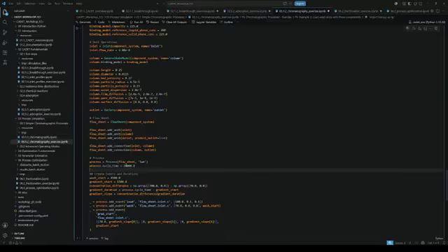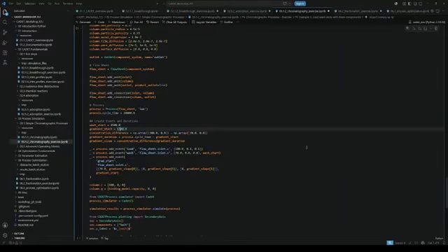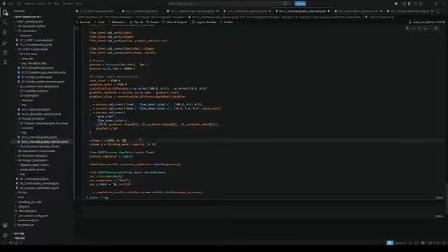Our process is to take up 20,000 seconds. And since this is a bind, wash, elute cycle, we have to define some timed events so that the wash starts after 4,500 seconds, and then the gradient of the elution of the salt will start after 6,500 seconds. And then we're going to run a concentration gradient from 70 millimolar to 300 millimolar salt in this time frame. And here we define the initial states of our system.